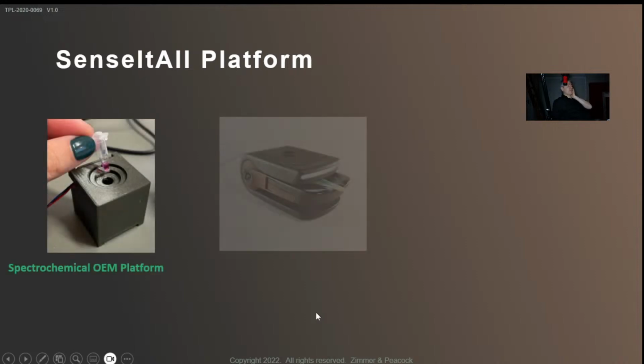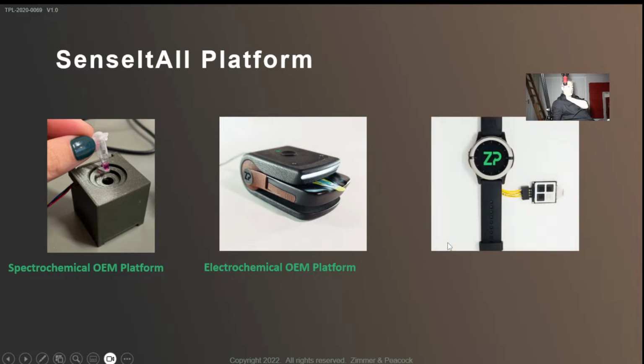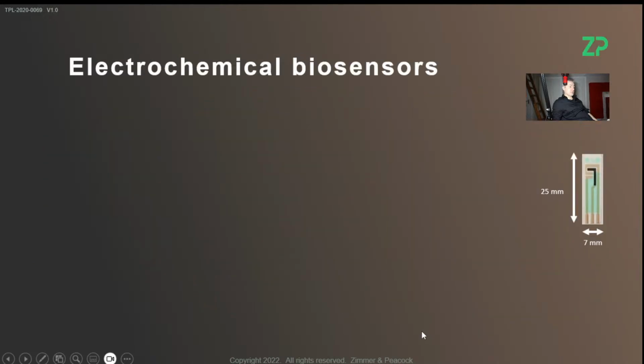We do have these platforms, and in fact we're doing some testosterone work at the moment on the central electrochemical platform here, and we also have a wearable platform. I'll talk about our cortisol work as well, but the one thing I should say is that at the moment, the only animal that is benefiting from at least our cortisol sensor is fish. Sounds crazy, but I'll give you a bit of background on that as well.